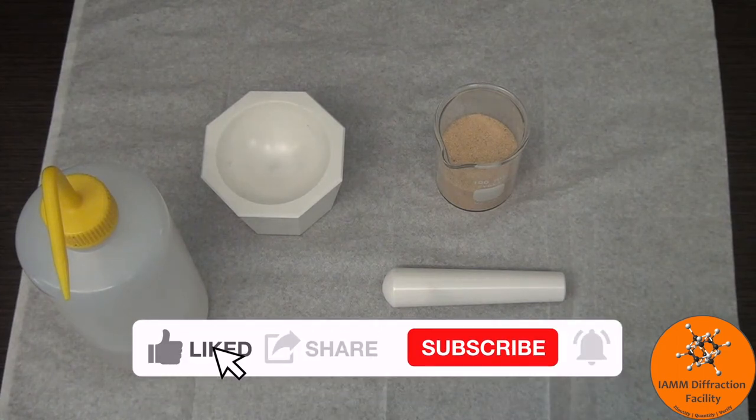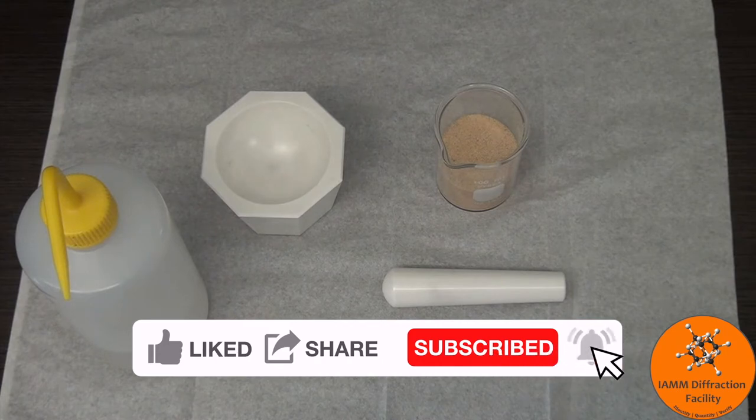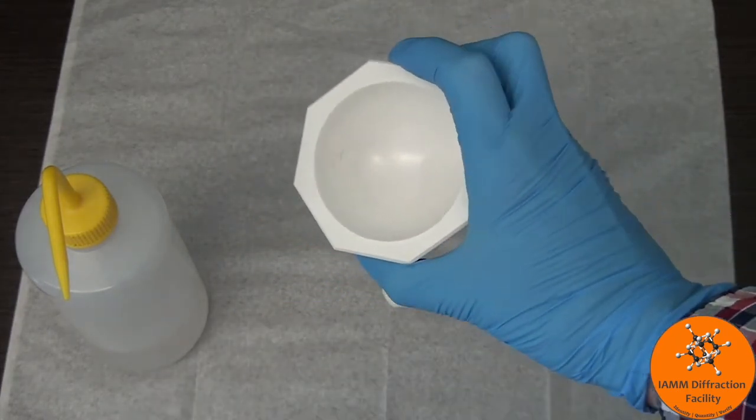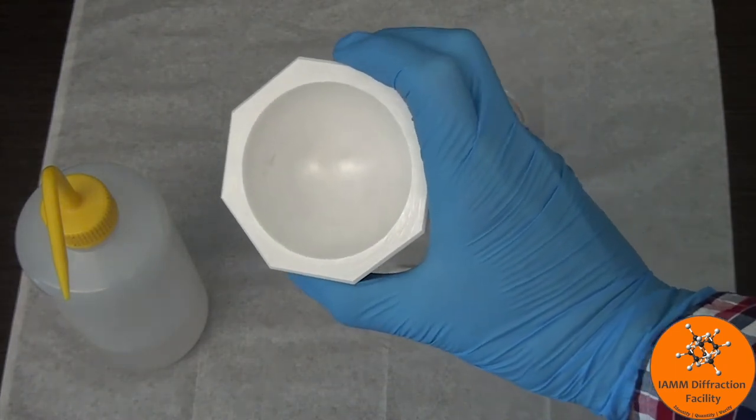This video will show you how to do a more in-depth cleaning of the mortar and pestle. As you can see here, it looks like someone might have tried to clean this one.